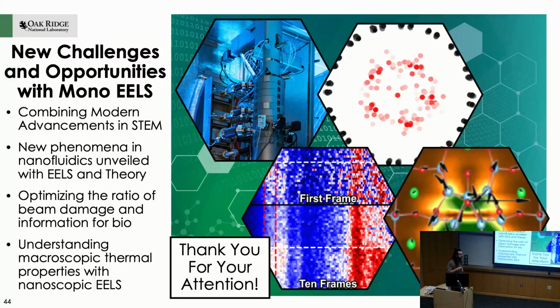What determines the variation of the water density in different nanotubes? Is it homogeneous in one tube? So what I have seen is when we see the vibrational spectrum at 460 or 420 in one spot on the tube, we see that same peak everywhere on the entire tube, for the whole millimeters-long length of the tube. Those higher energy peaks that I showed at the end, which we don't really understand, will vary quite significantly from spot to spot, but the OH stretch mode itself seems to be very consistent even across the entire tube.